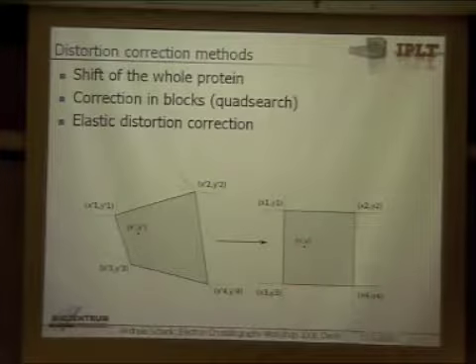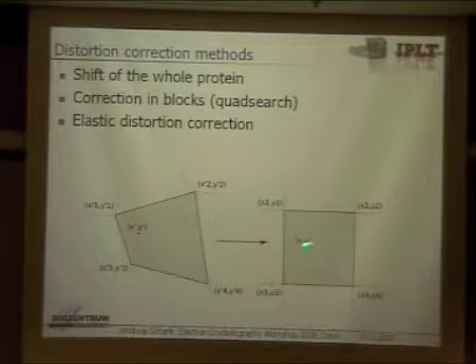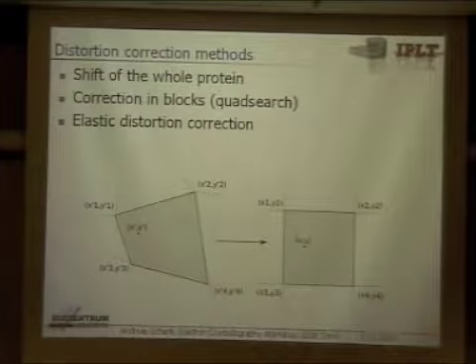So this gives you really a different shift for every pixel in the image. Then once you know the original position, if you're not directly on the pixel but in between some of them, you can just do the interpolation and write back the grayscale value into the undistorted image.